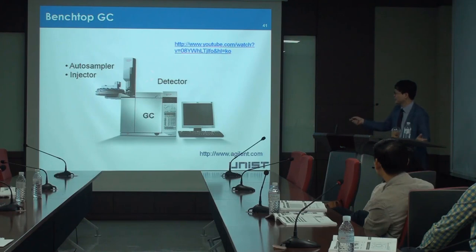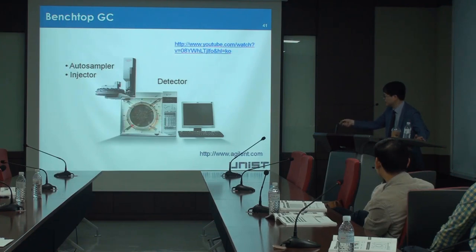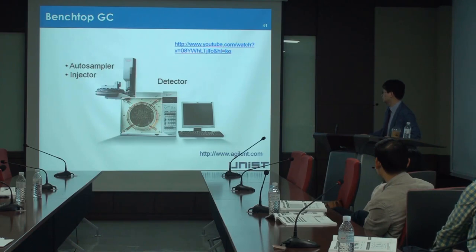But right now, we can use the auto sampler. So usually you go home, just put the samples in and it's gone, okay? They are analyzed automatically, it's good. So this is the auto sampler and the injector here. Here is the GC oven, wide open. This is a capillary column, generally about 30 or 60 meters. Generally we use a 60 meter column. Okay.